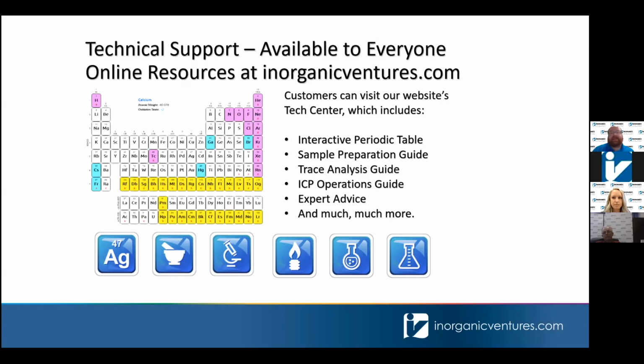I would add to that too, Autumn, I've noticed on our mass spec, you can go as low as 1% HCl for lower levels of mercury, and I don't think we've seen any stability issues. If we go to nitric, though, we have a lot of problems. Even with gold from time to time, it doesn't last forever, so just keep that in mind, run it versus fresh standards, and make sure you're testing what you think you are.